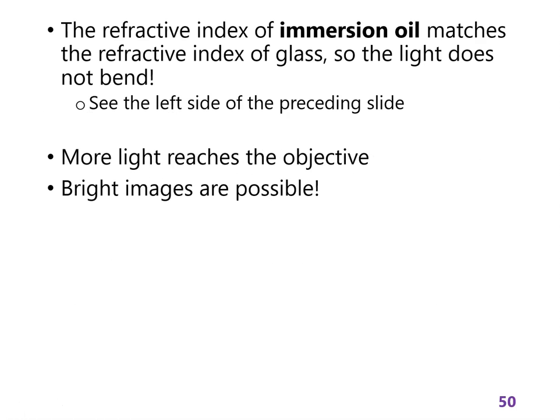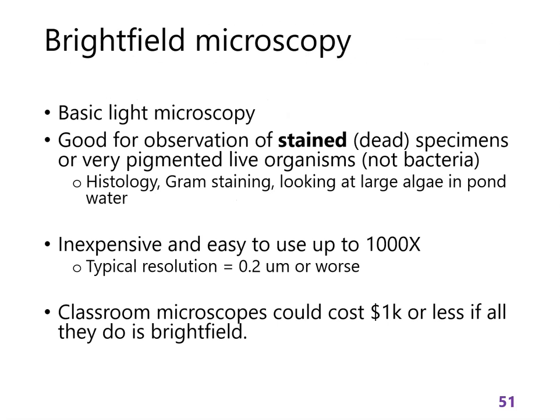So I just showed you that because that really is your nemesis if you're in a physical microbiology lab. The hardest thing you will do, literally the most challenging thing in a microbiology class, is learning to focus a 100x objective lens on a thin preparation of bacterial cells. It is 100 times harder than looking at a histology slide. So there's that. Okay, so what are the types of microscopy?